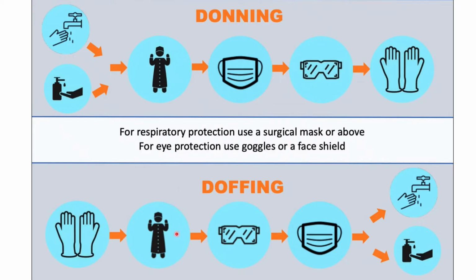Well, for the recommended steps of taking off your personal protective equipment, first, you have to remove the gloves. Remove the gloves without touching the contaminated area. So if there's a way for you to remove your gloves without touching the outside portion of the gloves, then you have to do so. Next is to perform hand hygiene if there is a sink or alcohol sanitizer inside the room of the patient. You have to sanitize your hands.